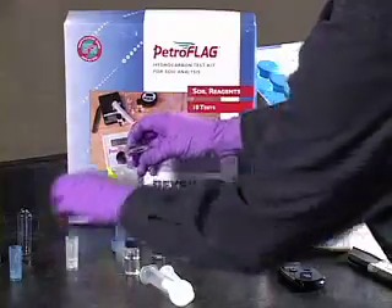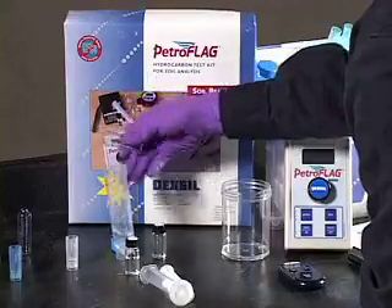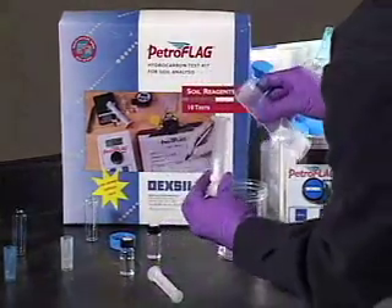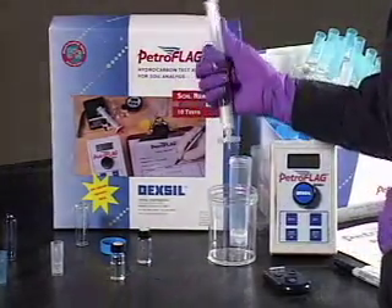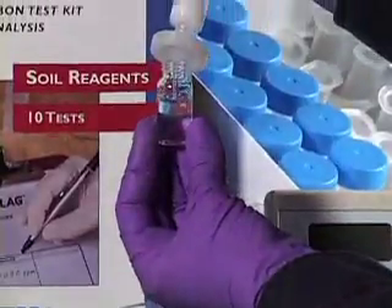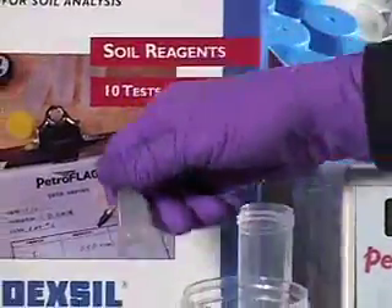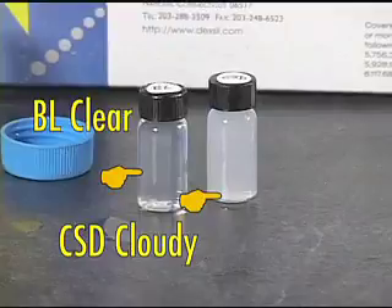Next, open the white capped vial containing the 1,000 parts per million calibration standard. Empty the contents into the second soil tube and thoroughly solvate the tube. Pour the solution into the filter and insert the plunger. Depress the plunger. Discard the first couple of drops and fill the developer vial marked CSD into the neck. Discard the filter assembly. Recap the developer vial and shake gently to mix the contents. Observe that the vial labeled BL is clear and the vial labeled CSD is cloudy. Set aside.